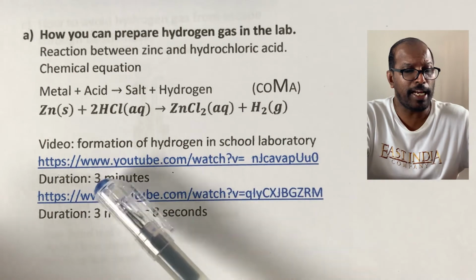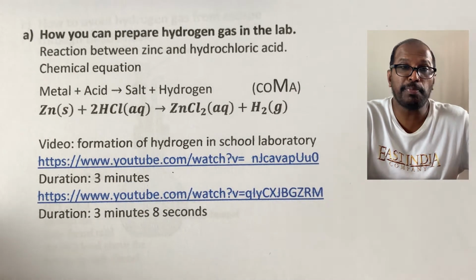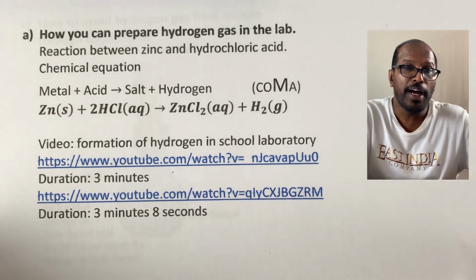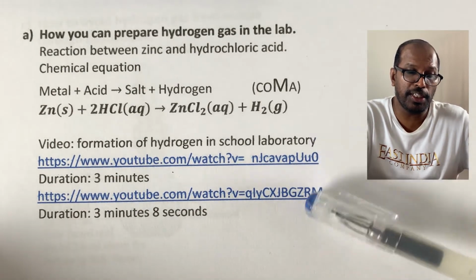I have given you an attachment of a video here for you to observe, and the video will explain how to produce hydrogen gas in a school laboratory, followed by how you know that the gas produced is actually hydrogen. So those are the two things that will be done.